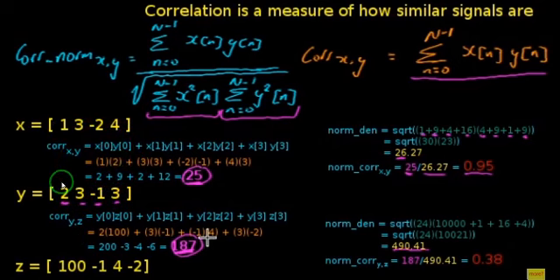Okay, now we use the normalized form. So this is the concept that we are going to use for getting the information about the size of the particles out of the pattern that our detector gives us.